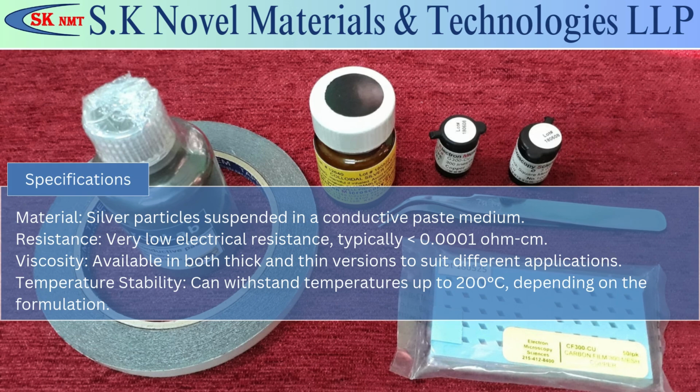Resistance: very low electrical resistance, typically less than 0.0001 ohm cm. Viscosity: available in both thick and thin versions to suit different applications. Temperature stability: can withstand temperatures up to 200 degrees Celsius, depending on the formulation.